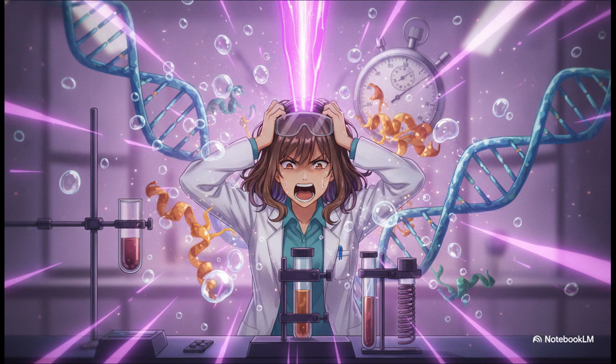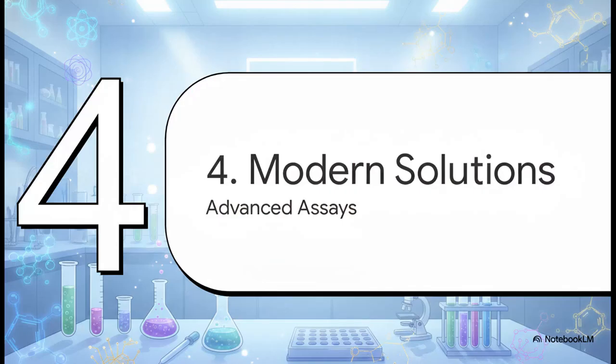Why? Because biological proteins and DNA also absorb UV light, completely skewing your data. Plus, those oxygen bubbles totally threw off the optical readings by scattering the light. Add in the fact that this happens in milliseconds, and you've got a massive headache for any analytical chemist trying to get clean data. Which takes us to Section 4, modern solutions and assays.